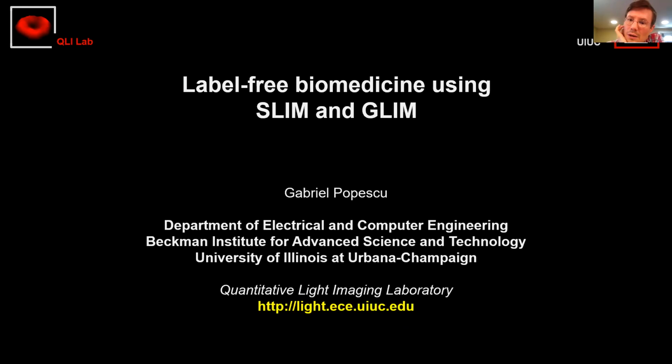Actually, I have. In fact, my PhD thesis was on light scattering, static but also dynamic light scattering, and then dynamic light scattering methods for microrheology, which is doing rheology at a very small scale. So what I showed you today, these quantitative phase imaging methods are, as you said, pretty ideal for doing microrheology, rheology at very small scales.